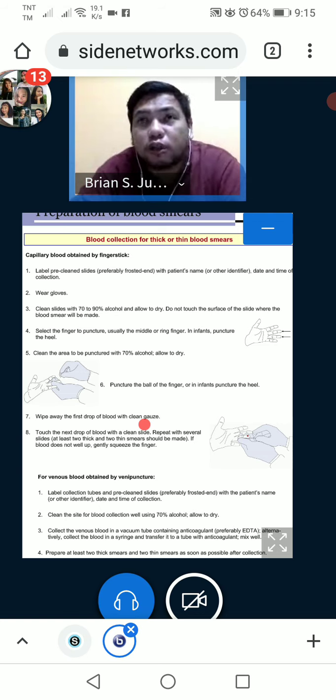So, ano pa ba? Although class, serological test ang ginagawa, they are still considering thick and thin smear as the gold standard for malaria diagnosis. Okay? So ano ba yung test or paano ba pini-perform ang thick and thin smear? So okay, ito yung step-by-step procedure.